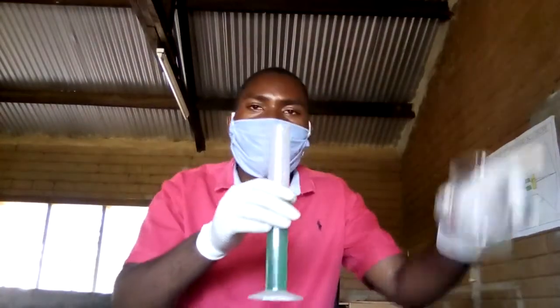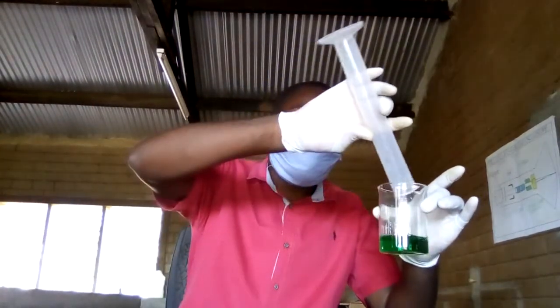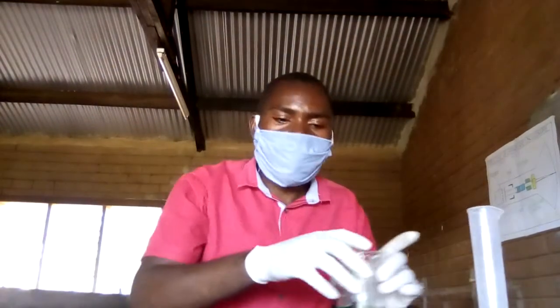Once we are done, again pour it in the empty beaker. So I'm pouring it into the empty beaker. After that, you put it on the beam balance, and with me here it is 150.9. So 150.9 minus 102.1, the answer is, oh wow, 48.8. That's the answer.